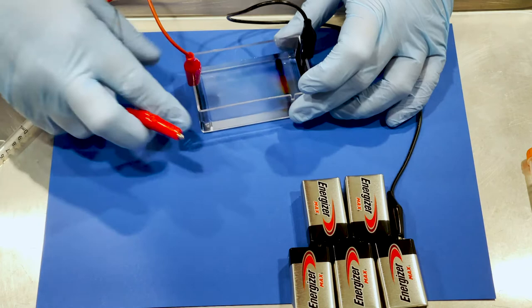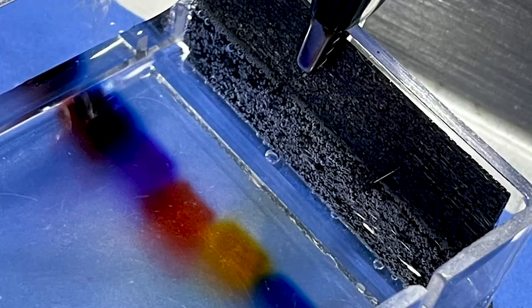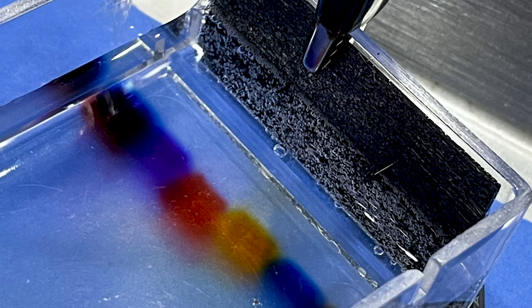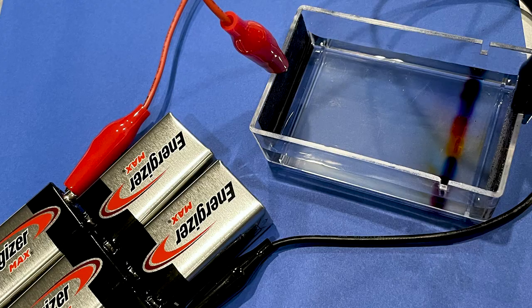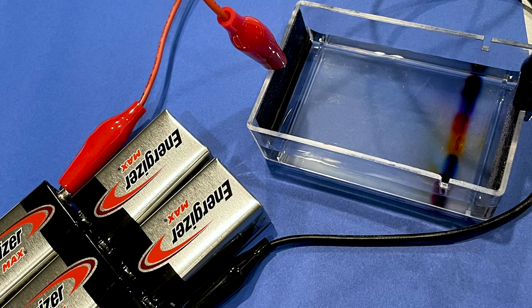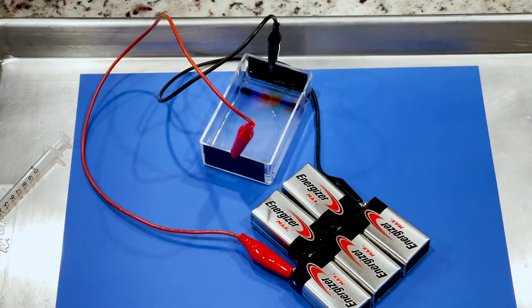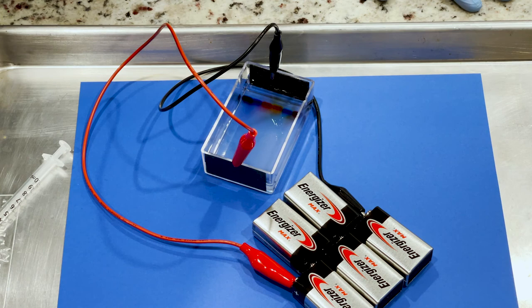You should notice bubbles start to form on the carbon fiber paper. The directions say it will take anywhere from an hour to three and a half hours for the dye to separate. Mine actually only took about 45 minutes with the five batteries. I recommend that you keep an eye on it and check it often because you want to stop the electricity when the farthest dye from the well is within maybe a centimeter of the end of the gel. You don't want the dyes to keep going because you don't want them to get pushed off the end. Once the dyes have separated out, make sure you take a picture of your gel right away because if you let it sit for a while the dyes will diffuse into the buffer and you won't be able to see your results.